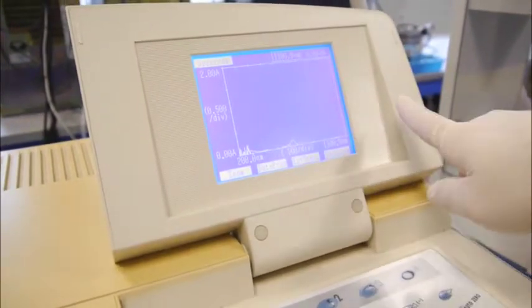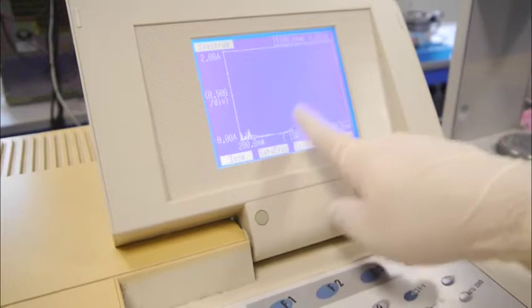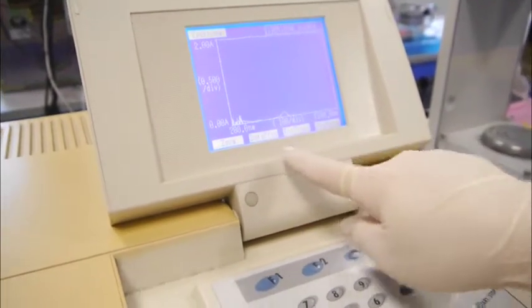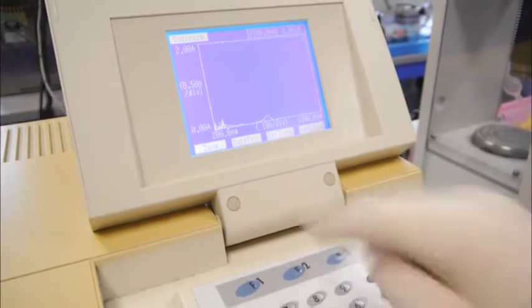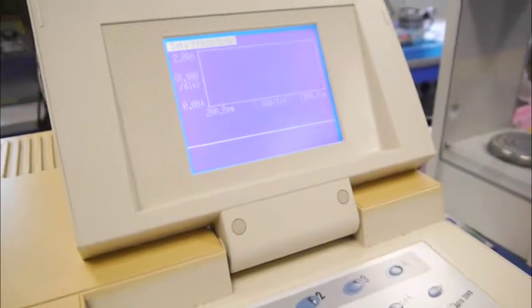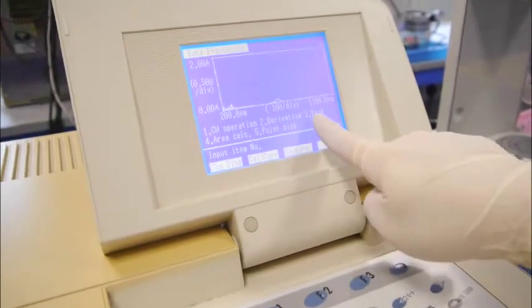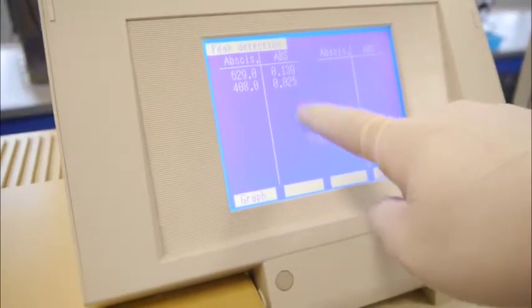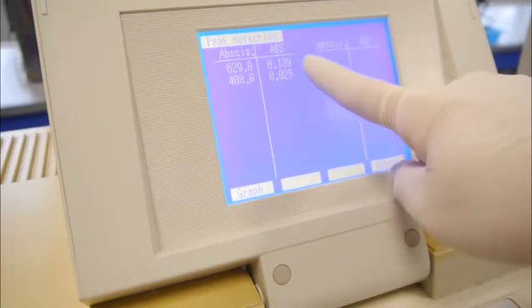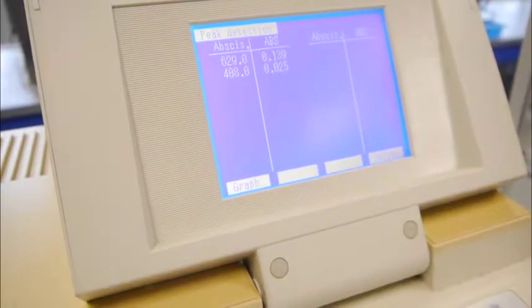After we press start, we are actually doing a scan through the spectrum to find the lambda max value. The scan has been done, so there is a spectrum generated. To find the lambda max value, we need to press F2 for data process, then press number 3 for the peak table. This will generate the table showing the absorbance value for the corresponding wavelength. In this case, the highest absorbance value is 0.139, so the lambda max value will be 629 nanometers.